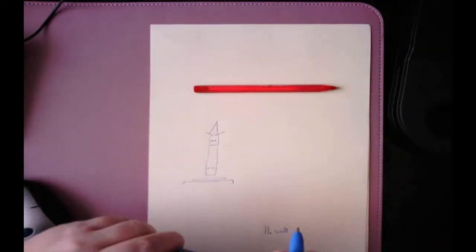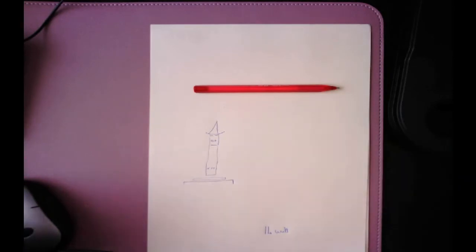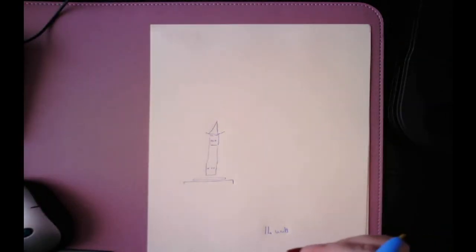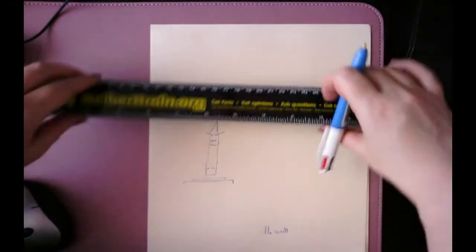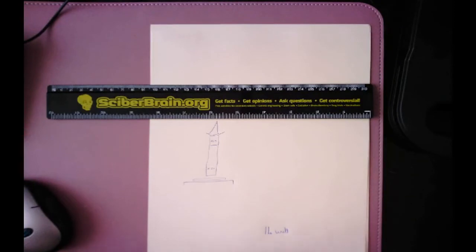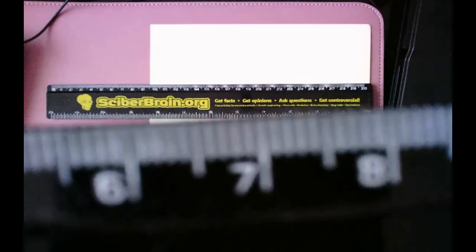but we know it's not that size. What I would then do is remove my sample from the stage of the microscope. I would put a known scale bar on my microscope using the exact same 2 magnification lenses, and put my eyepiece one up again.